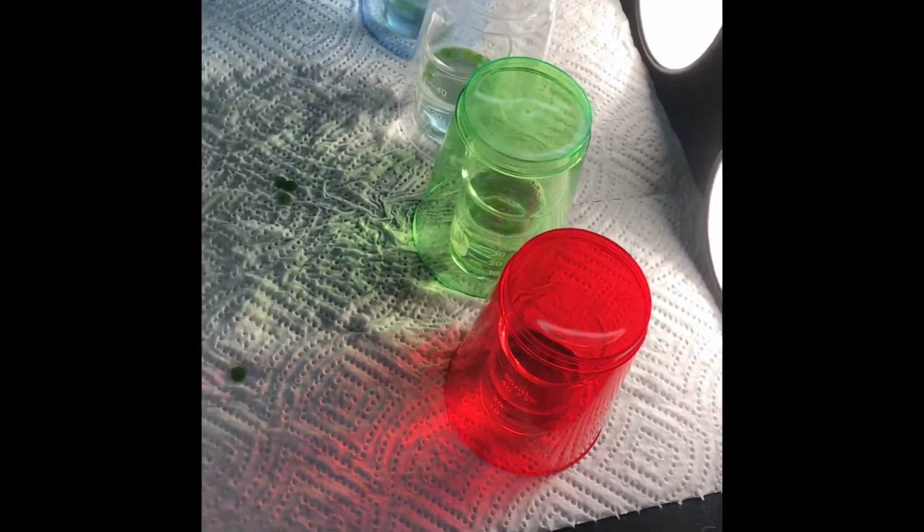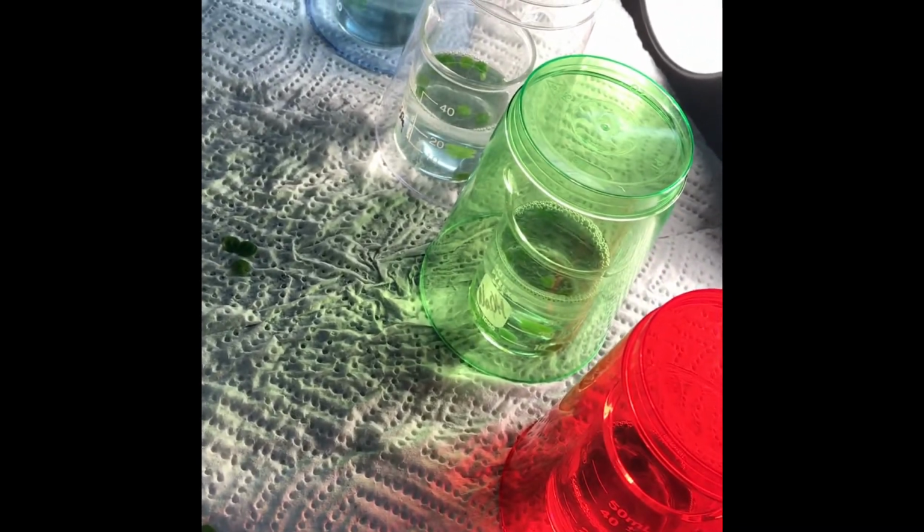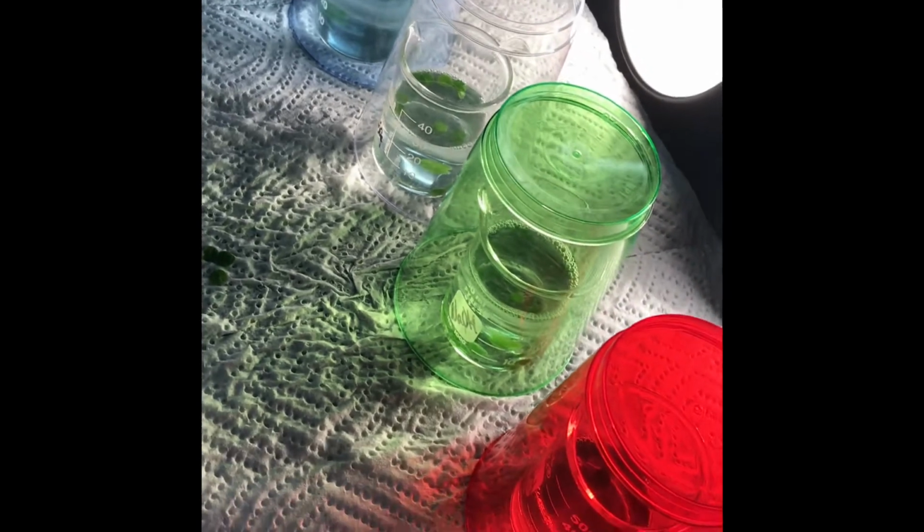Okay, so they have part A up and running. You can see the lamps. So what they did is they used little baby beakers, and underneath each of the colored cups in the clear cup, there is a, you can see it right there in the clear one, there's a beaker filled, isn't that cool, with the spinach chads. And so the light is on, and they're getting some good data.